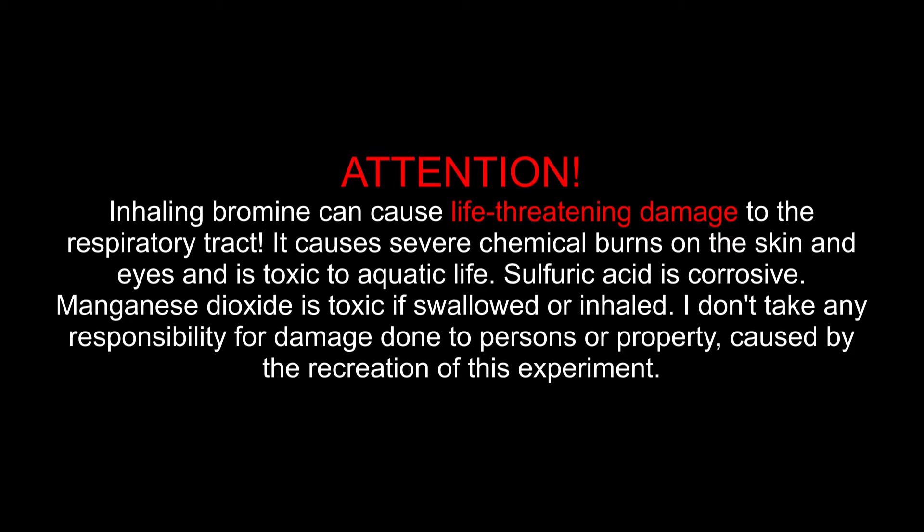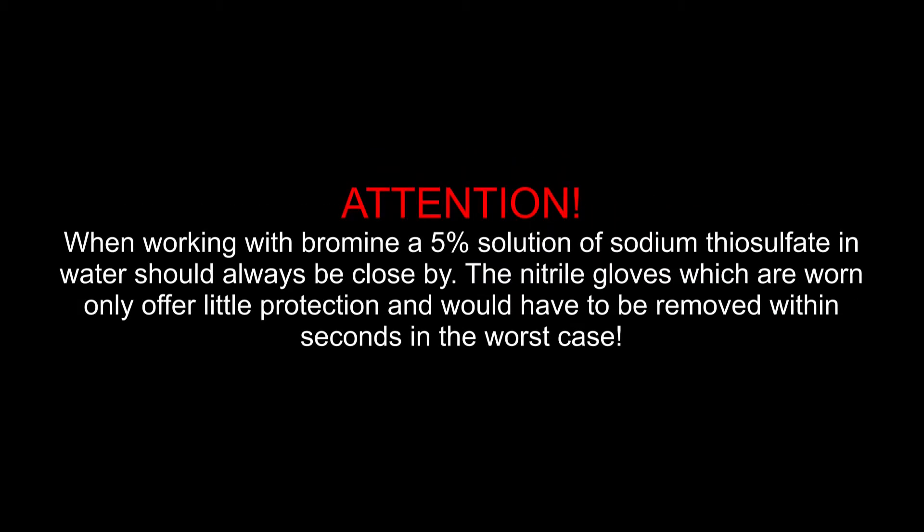I don't take any responsibility for damage done to persons or property caused by the recreation of this experiment. When working with bromine, a 5% solution of sodium thiosulfate in water should always be close by. The nitrile gloves which are worn only offer little protection and would have to be removed within seconds in the worst case.